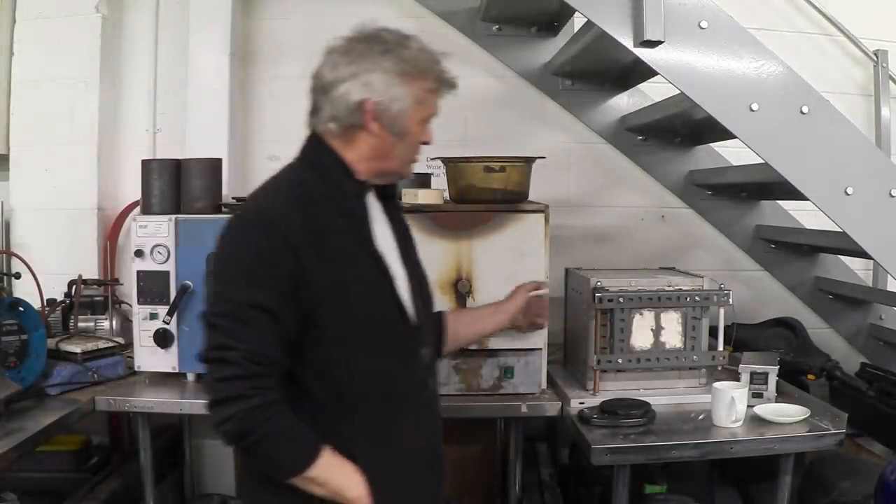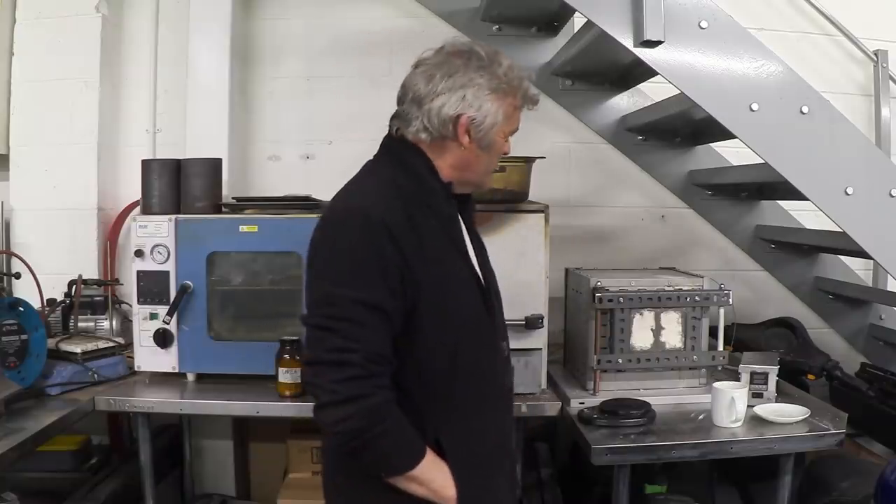Here's our new kiln, pride of place next to the lab kiln that I bought. We're going to give it quite a lot of use. I've obviously been playing with it a little bit and to be honest it's awesome. What we're going to use it to make is some graphitic carbon nitride.